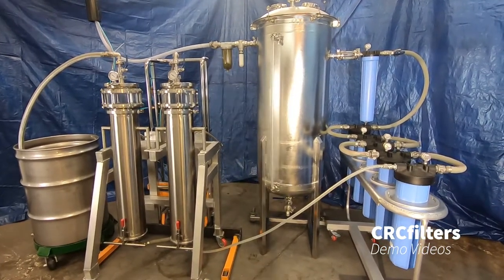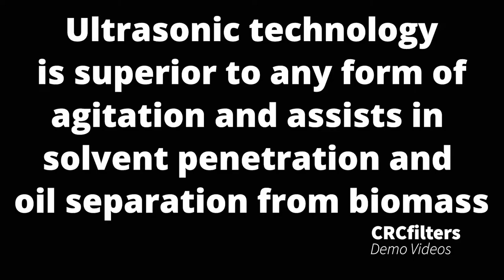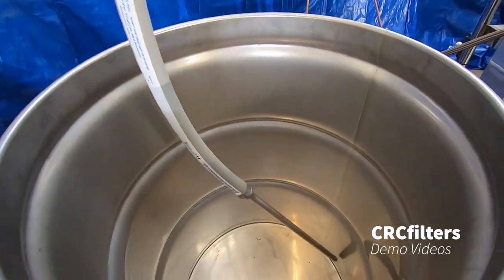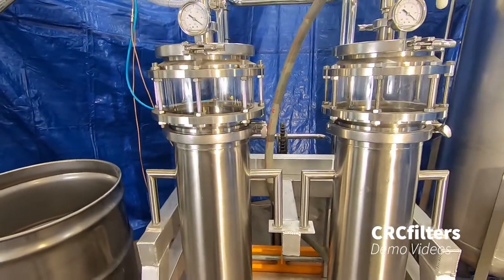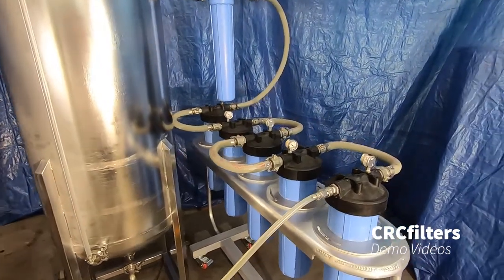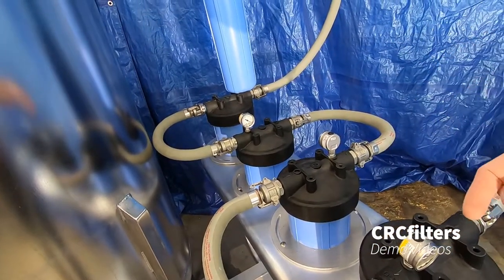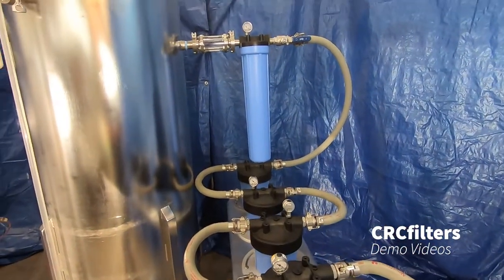Today I want to show you the ultrasonic extraction and purification system we've got for sale. This is vacuum operated — it uses vacuum to draw the solvent through the material. This is our suction line that drops into a 55-gallon drum for your solvent. From there we get to our 10-pound ultrasonic columns. We've got two of those run in series, and then we have a six-stage purification system. These are much more efficient and less expensive than the lenticular type. You'd typically run three carbon filters in the center and they can be rotated so you're not wasting your filter and having to replace it before it's fully used up. Then we've got all the way down to a 0.22 micron polishing filter.